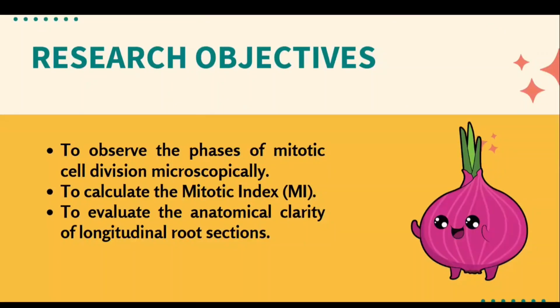There's a research objective. The objectives of our study are, first, to identify and classify the stages of mitosis microscopically. Second, to calculate the mitotic index as an indicator of active cell division. And third, to observe how anatomical context is preserved in a longitudinal section.